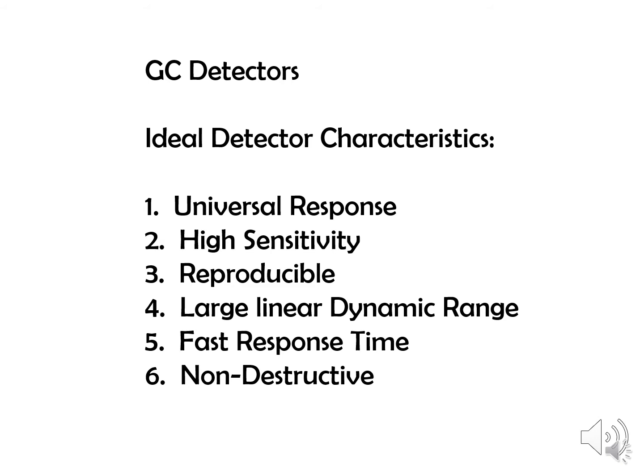You'd like sensitivity. You need to have reproducibility. You like a large dynamic range, linear dynamic range, if you're going to do quantitative work. Some detectors are very, very sensitive, but they're not very reproducible, and they're not going to have a very large dynamic range. Ones that we use for quantitation, we really need to have reproducibility in the large dynamic range.